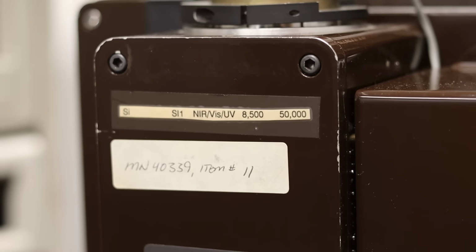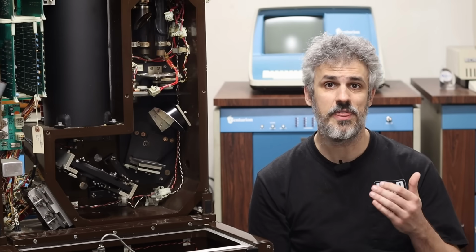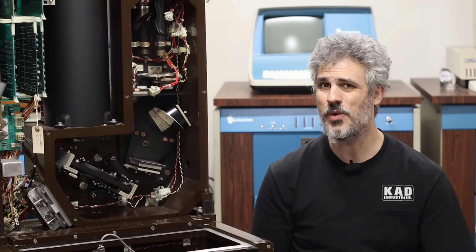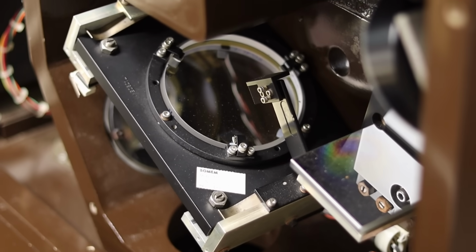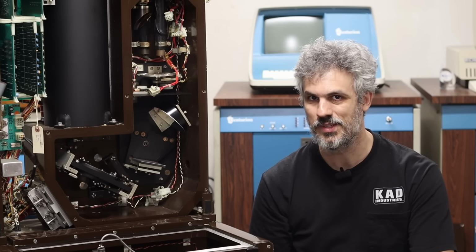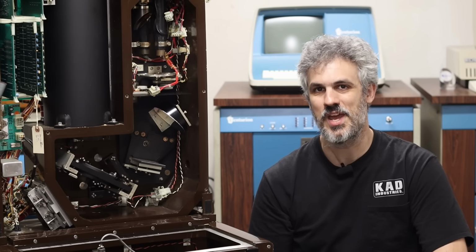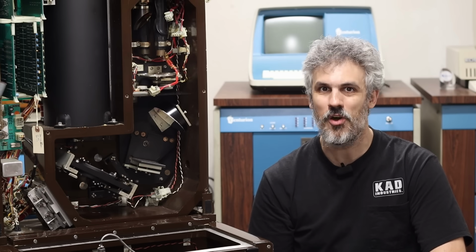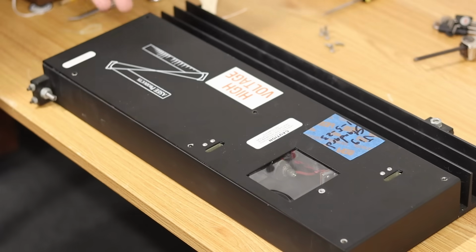So like 90% of this is just steering and focusing the beam. But why do we have this wild piece in the middle here with a beam splitter and two mirrors that essentially just reflect it back to it? Well, there's one more piece here that I haven't mentioned yet, and that is that there's actually also a laser involved with this thing. And this nondescript looking black box is it.